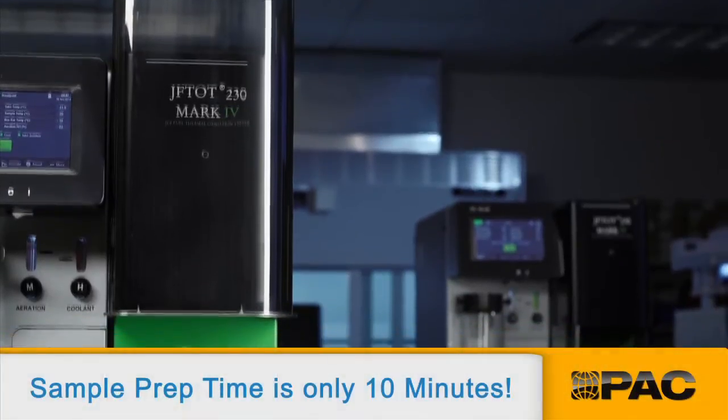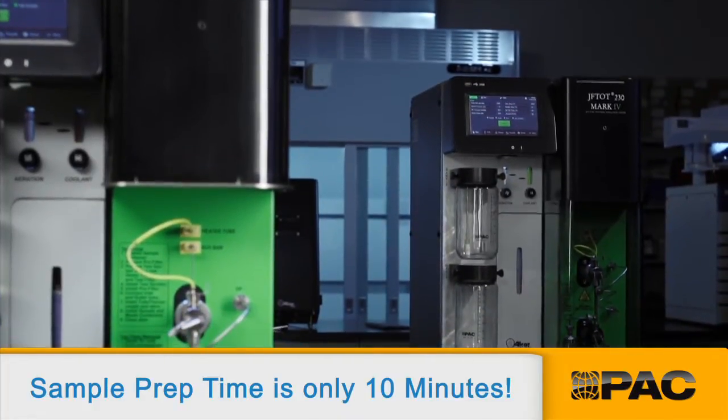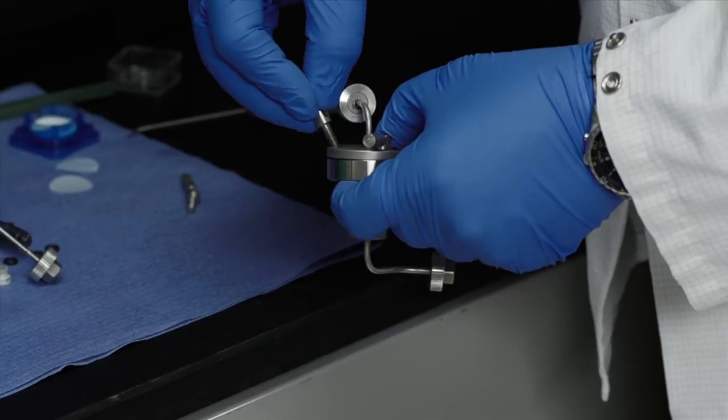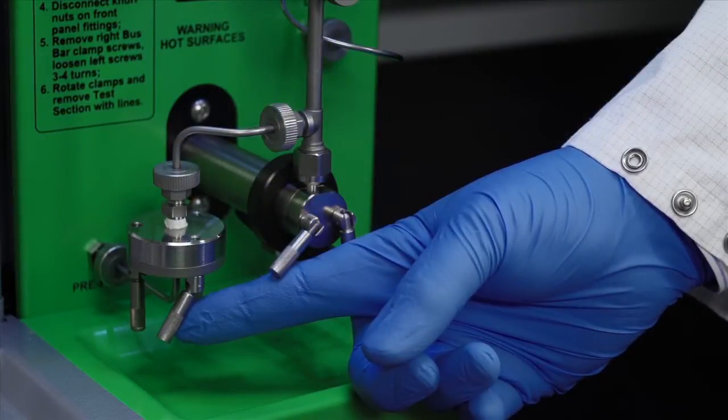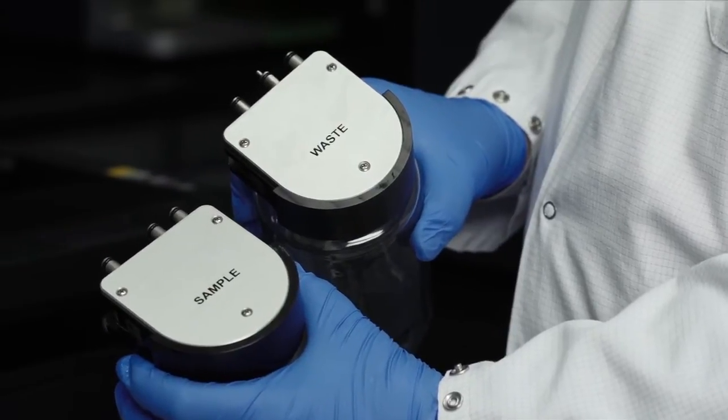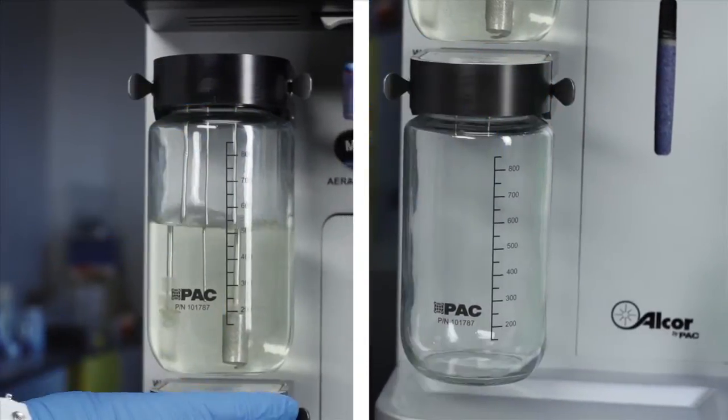One of the most valuable features of the Jephtot 4 is the amount of necessary sample prep time that we've eliminated. We use swivel screws in place of hex head socket screws, so you no longer need a special socket driver. The sample and waste container quick connects to the unit, and previously time-intensive manual activities are now automated.